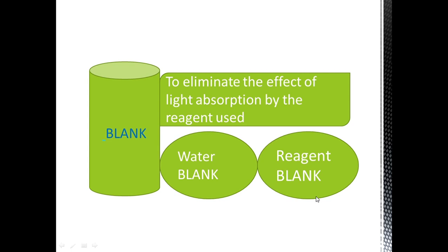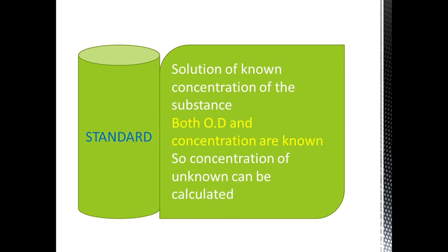Then only the correct amount of analyte or unknown concentration can be measured. Next one is the standard solution, a set of standards. They are solutions containing a precisely known concentration of a substance or analyte. Normally, they are placed in an increasing concentration.